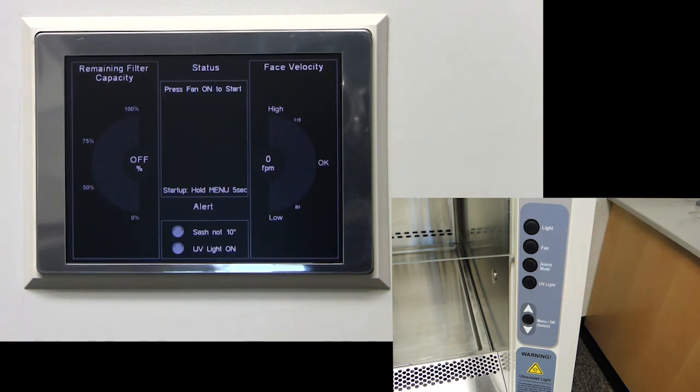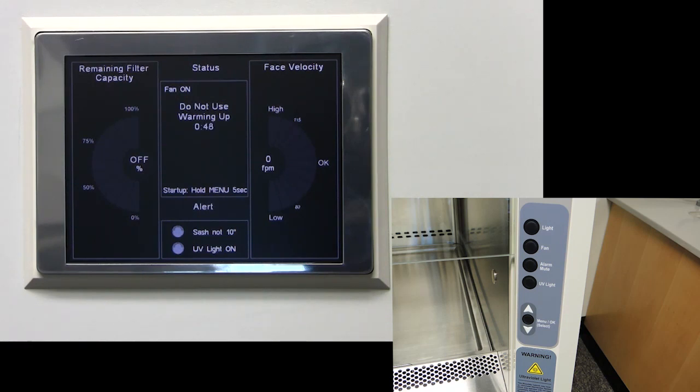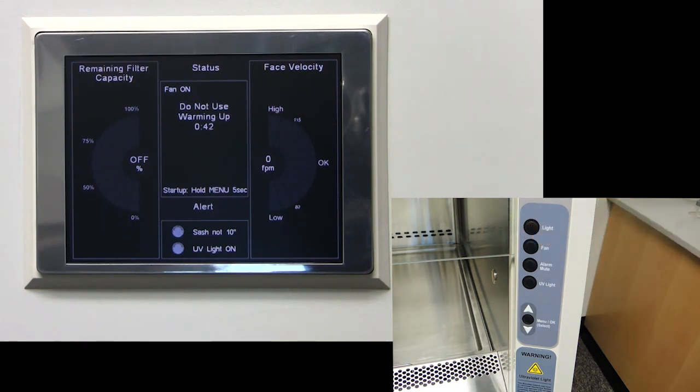Press the fan button to start the unit. Factory fan ramp up time is 5 minutes. We have set ours to 1 minute for demonstration purposes. During the ramp up time, no alarms will sound. The light may now be switched on or off. The light does not work on the startup screen.